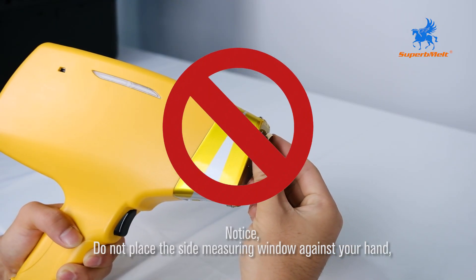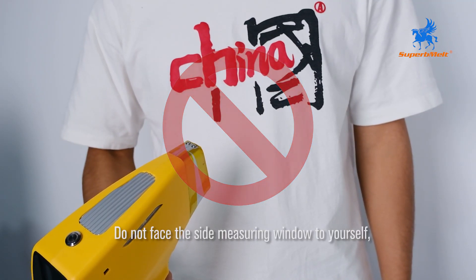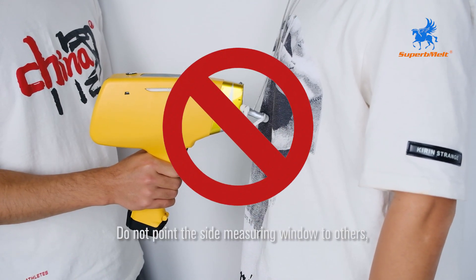Notice: Do not place the side measuring window against your hand. Do not face the side measuring window toward yourself. Do not point the side measuring window at others.